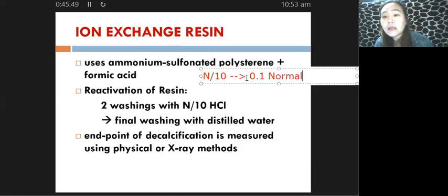So another formulation of RAF that we can use is 40%. This 40% RAF is utilized for large pieces of dense bone samples. When we say dense bone samples, we are referring to your cortical, or compact, bone samples. So how do we perform the decalcification of your compact samples using 40% RAF?